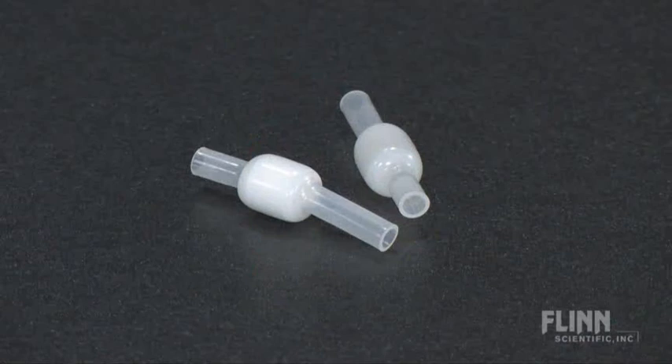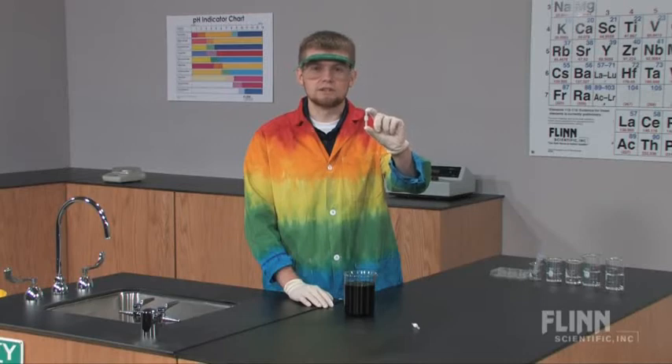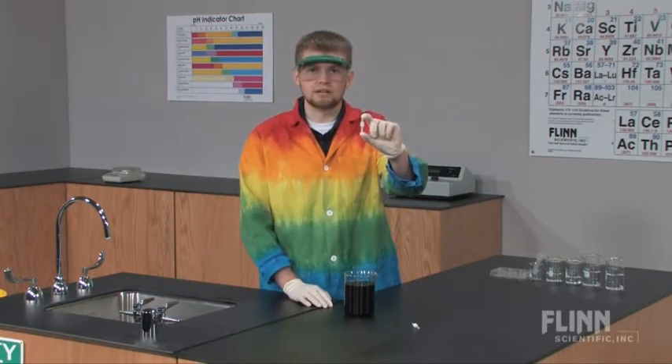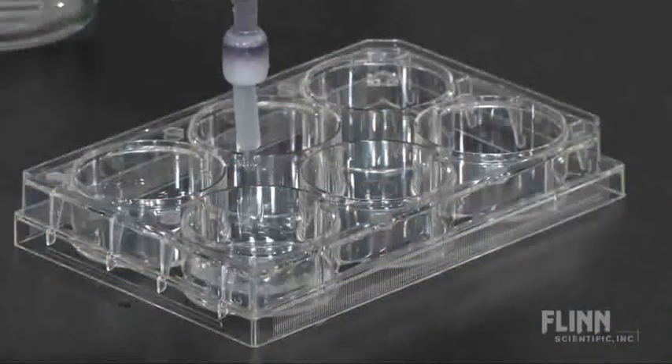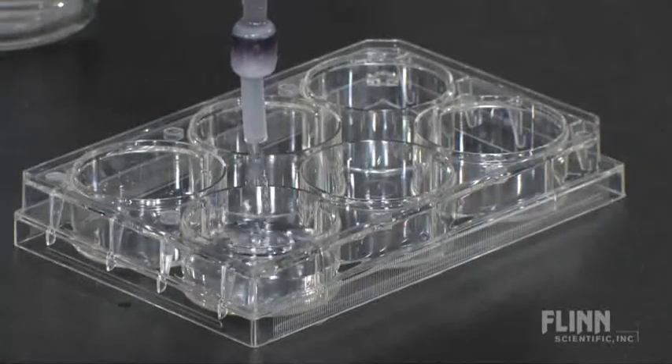Your students will be amazed when you cleanly separate dyes with a convenient small-scale column chromatography demonstration using a CEPPAC cartridge. These mini columns consist of a material that readily absorbs and then separates polar and nonpolar substances from an aqueous solution, such as grape Kool-Aid. Simply load the sample in the cartridge and pass a rubbing alcohol and water solution through the column.